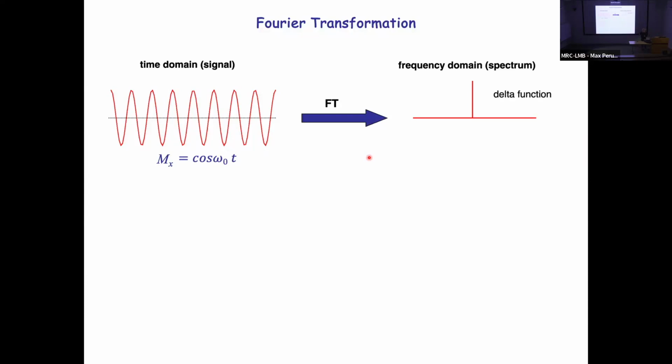It describes a single discrete frequency with infinitely narrow width. But in practice, we have the magnetization at thermal equilibrium. We flip it into the XY plane. We record its signal in the receiver coil. And as we're recording, it's returning back to its thermal equilibrium position, its so-called relaxation process.